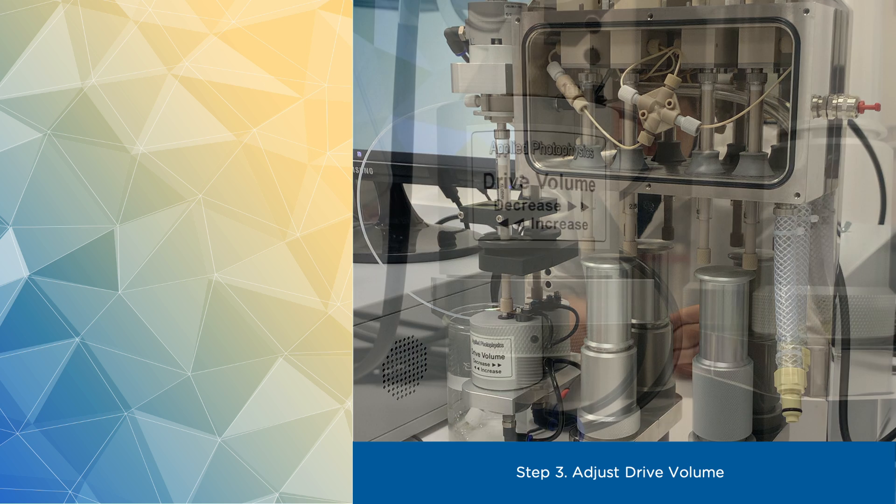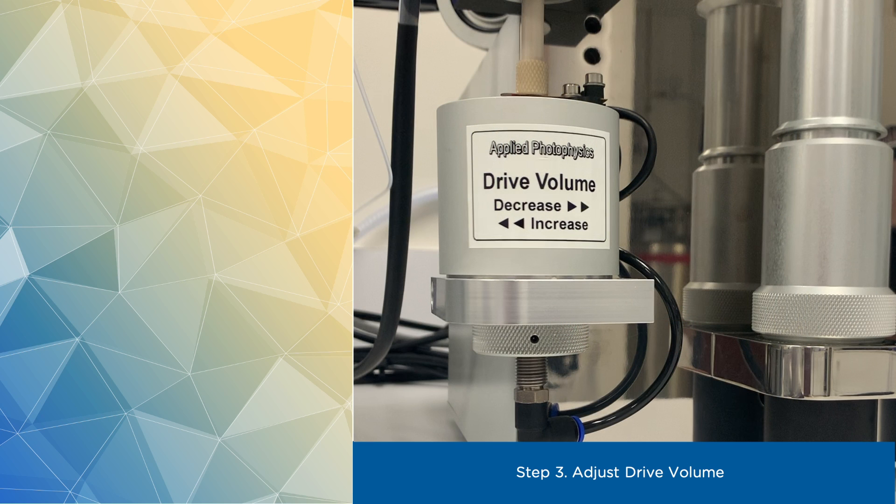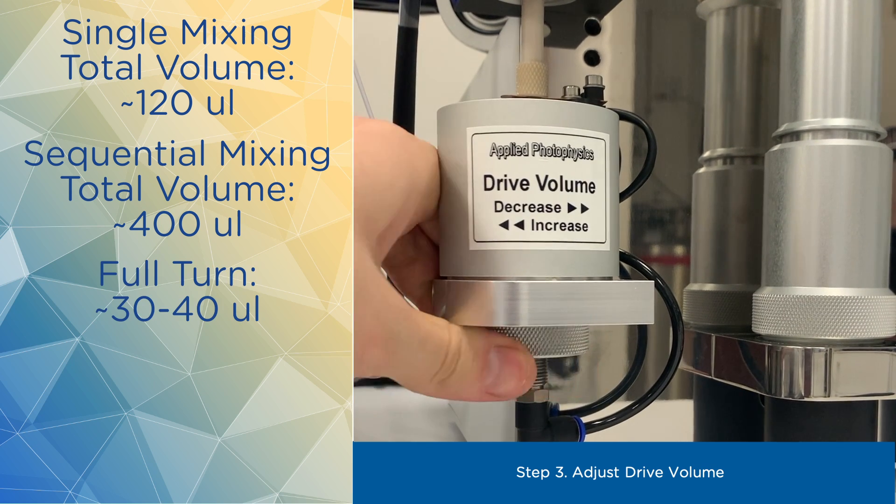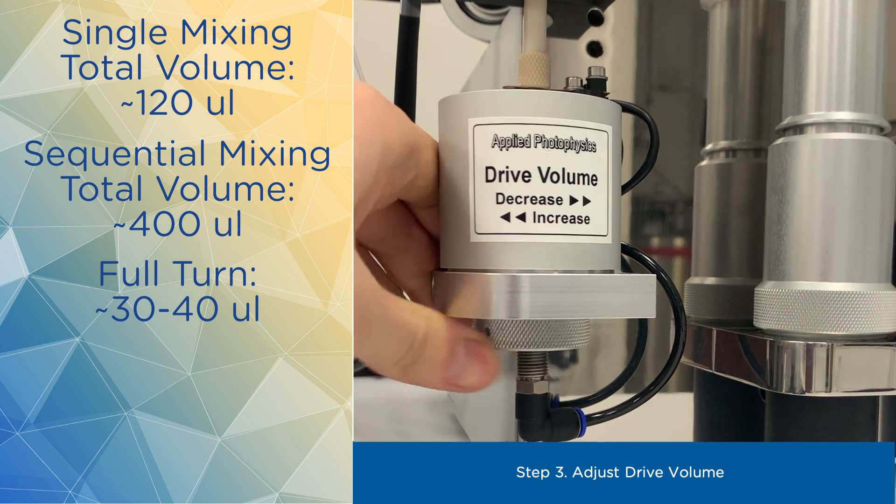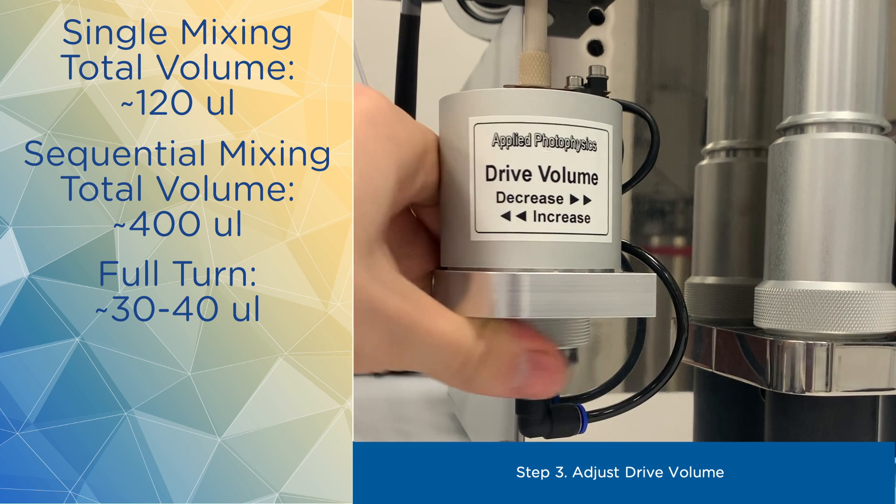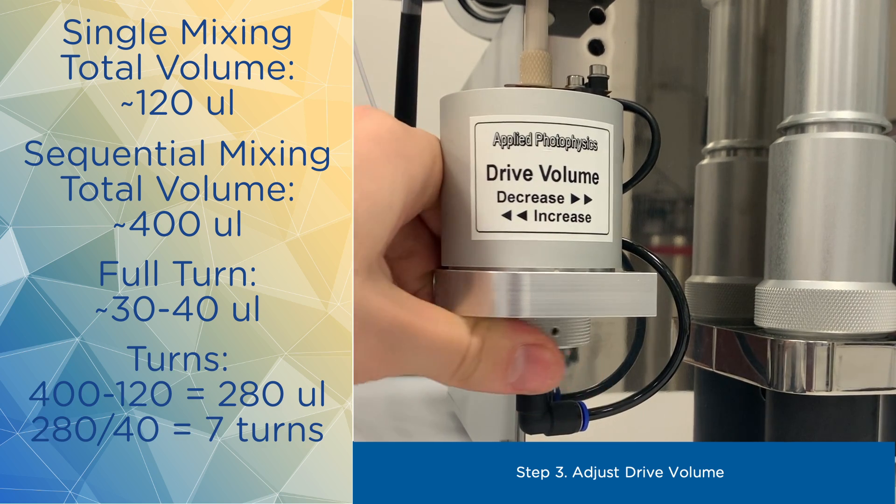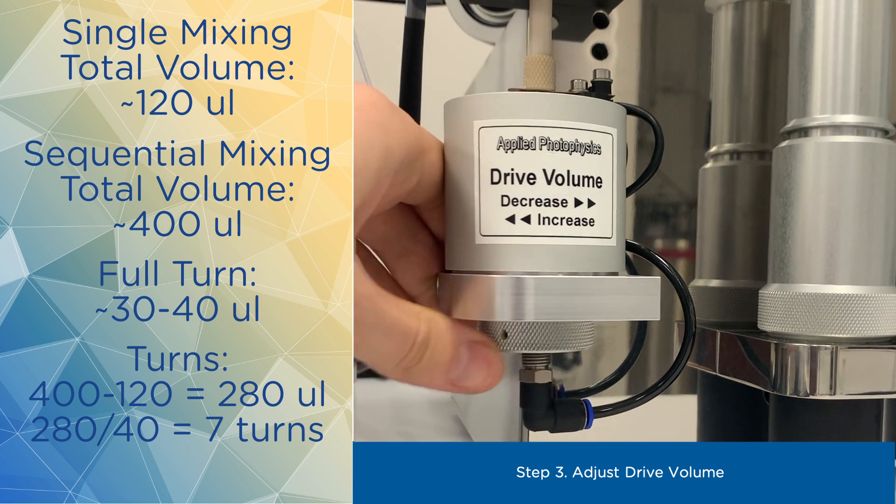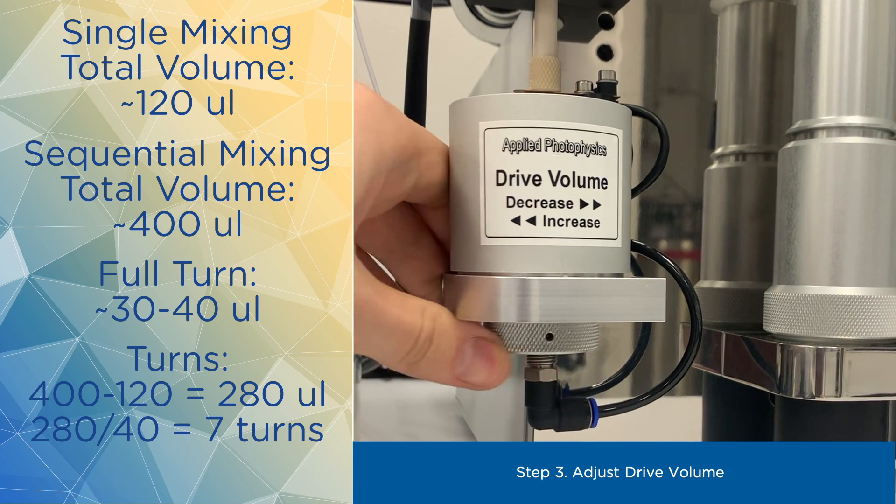Next, we adjust the total volume by turning volume adjuster underneath the stop syringe mechanism in the direction of the arrow. Typical drive volume in a single mixing mode where the drive syringes have a volume of 2.5 mils is around 120 microliters. And for sequential mixing, recommended total drive volume is 400 microliters. A full turn of the volume adjuster corresponds to about 30-40 microliters for a 2.5 mils stop syringe.